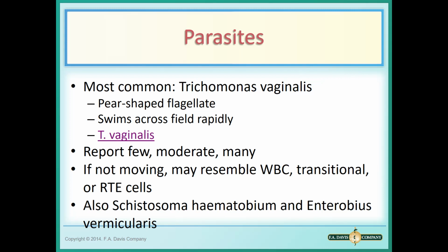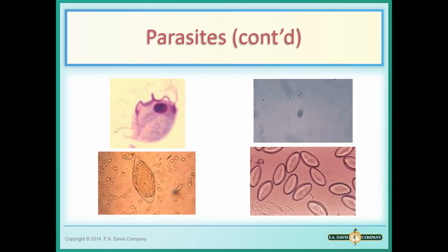But in the advent of having the world be connected, wherever we go by a plane flight 12 hours, 24 hours away, it's not impossible to see Schistosoma, so we're going to take a look at it. And then Enterobius vermicularis, we see this in its pinworm eggs, especially, and we see it if there's fecal contamination typically. So let's take a look at those.